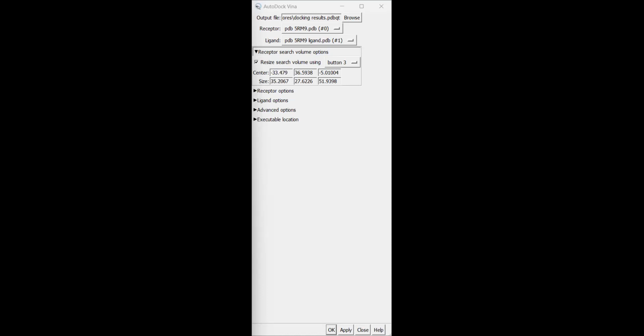So luckily for us, we know that this fragment binds in this pocket because that's a crystal structure. It's based on a PDB structure. So what I'm going to do is just confine the size of that grid to around that pocket. Okay, so we're just to the right of the ATP site on the RecA2 domain.